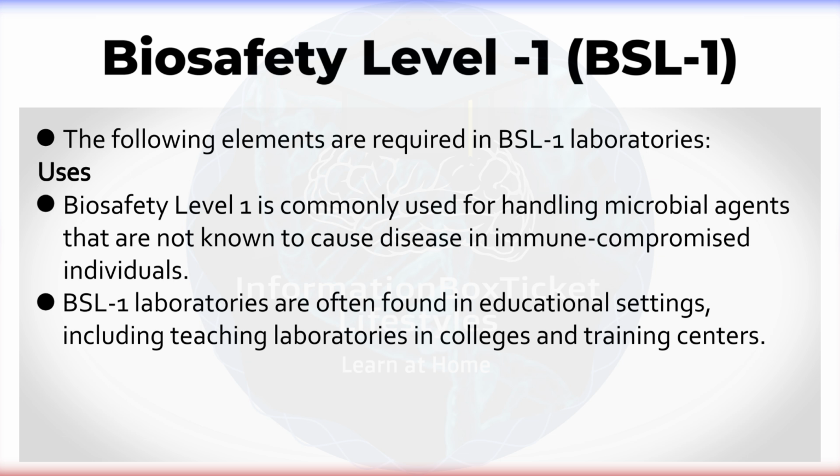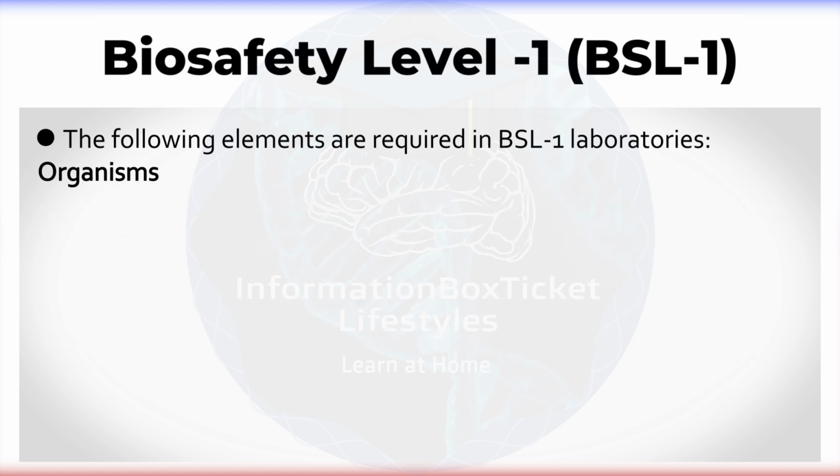BSL-1 laboratories are often found in educational settings, including teaching laboratories in colleges and training centers. Organisms.